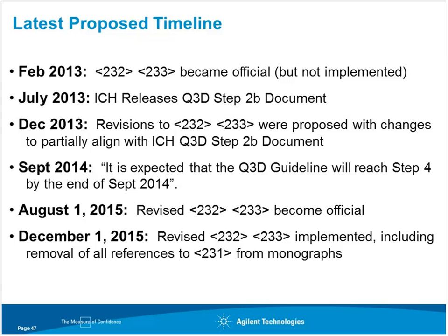I think people are starting to realize that they have to purchase the instrument. In some cases, they have to train the analyst. They have to validate the products. So when they start thinking backwards in terms of how much time this is going to take, they realize that December 1st, 2015 is coming up very quickly. So please let us know what we can do to help you with any of the decisions that need to be made around implementing these methods in your laboratory.